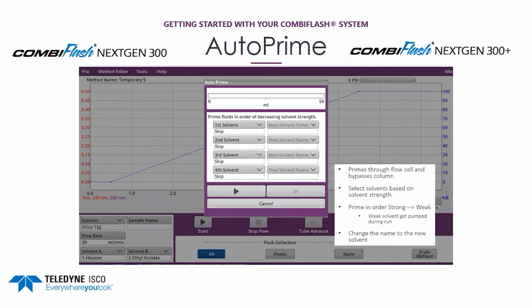Some systems, such as the CombiFlash RF series and the NextGen 100, need a priming tube installed to do the priming. Strong solvent is the solvent that causes the compound to elute faster, usually ethyl acetate or methanol.